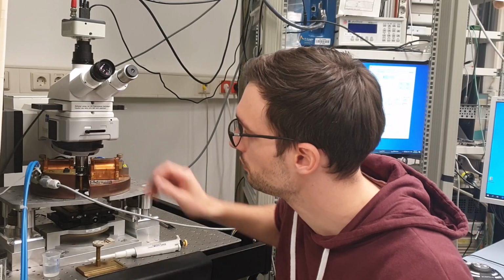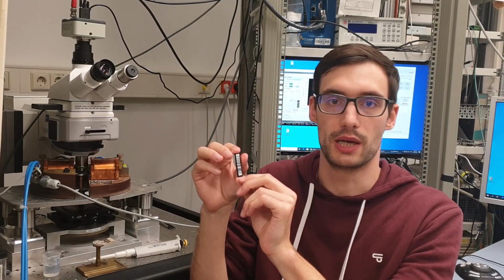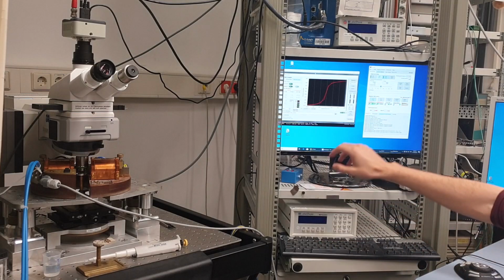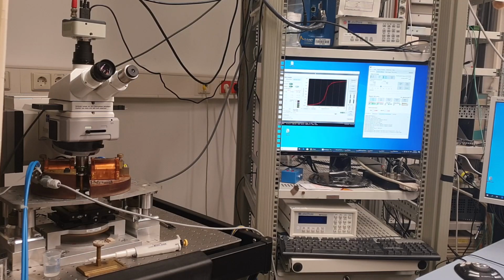And here we look at an amorphous nickel iron sample, which is commonly attached to some products and articles to prevent shoplifting. So maybe some of you are familiar with these little stripes and have seen them on some products already. So here you can see a pre-recorded magnetization curve. The acquisition time of a magnetization curve depends more or less on the signal to noise ratio, and in this case the acquisition time was around 30 seconds. And Kerr microscopy also allows to visualize the magnetic microstructure.